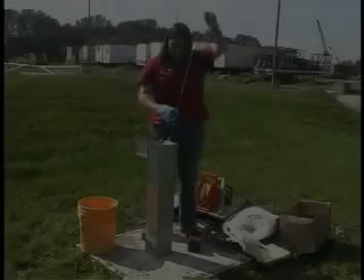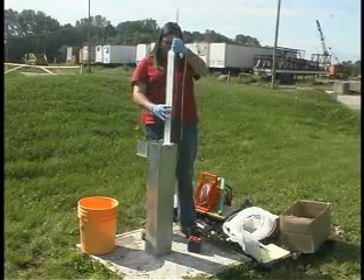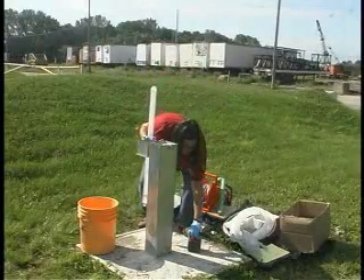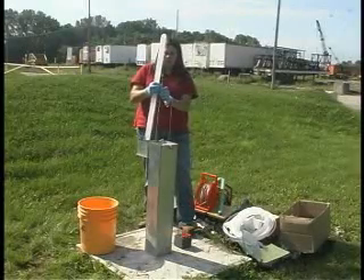Groundwater sampling with the baler is a somewhat easy way to sample groundwater. It's a fast and easy way to get groundwater up to the surface. One simply drops the baler into the well, brings the water up, and we are able to fill our sample.